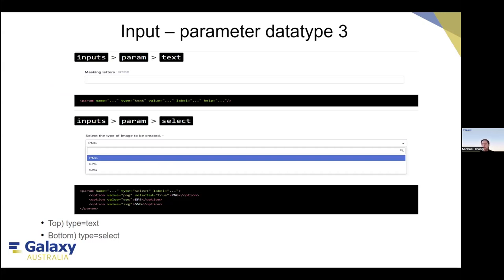Data type three — text — allows you to put in text. The data type is simply equal to 'text'. For the select parameter type, it's quite common to have a dropdown selection. With some tools, you can produce different data types. Using the select parameter, the interface shows a dropdown list. For example, you can allow the user to select PNG, EPS, or SVG as the output format. In the XML, 'selected=true' on PNG means PNG is the default output format when the tool is used on Galaxy.